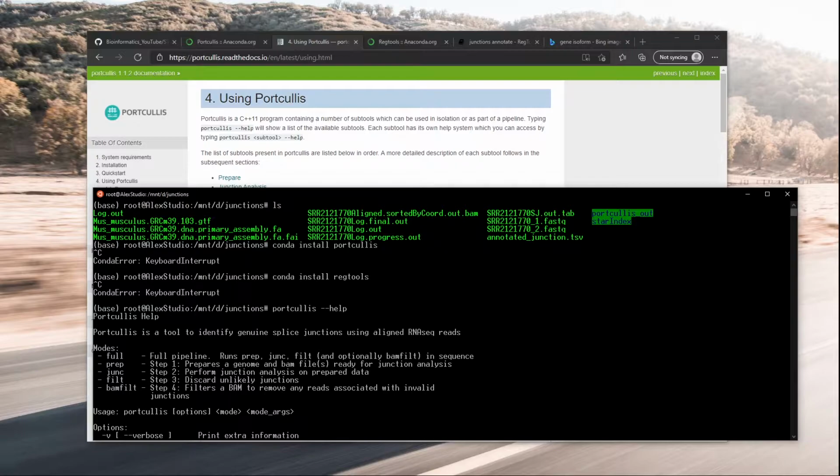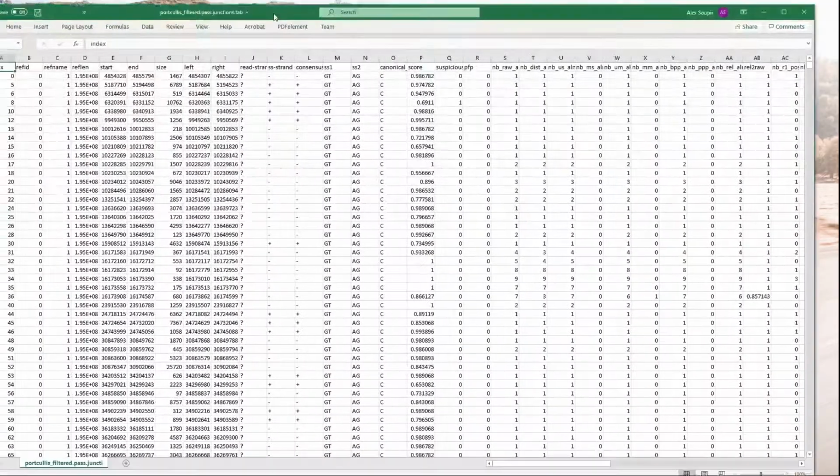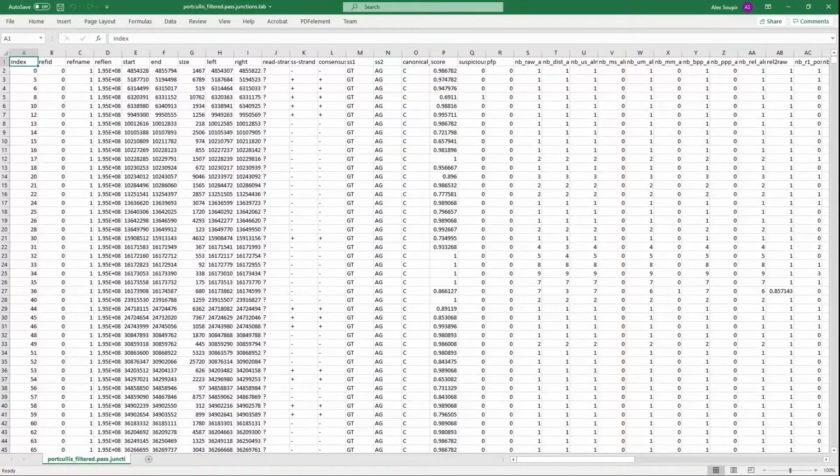So if we scroll back up, that BAM file that I aligned was here. This is one of the shortened ones that are on the GitHub page for the bioinformatics RNA sequencing stuff that are in the old videos. So I just downloaded this and then unzipped it, and realigned it to the genome after running the STAR indexing stuff.